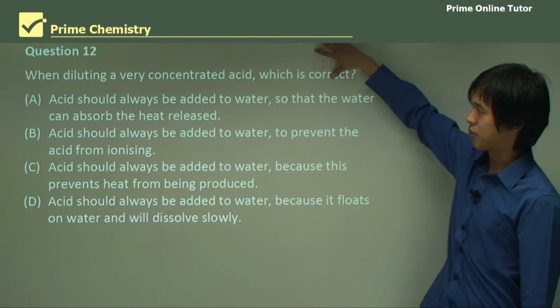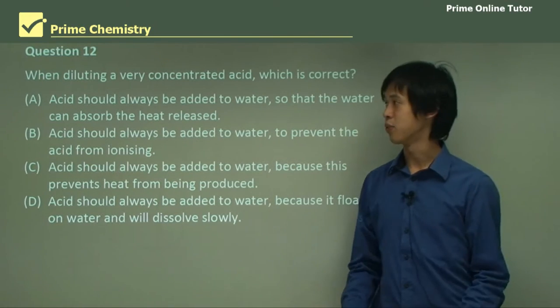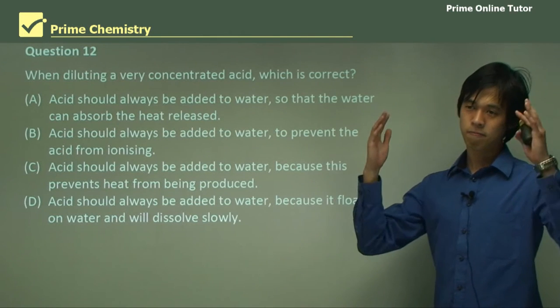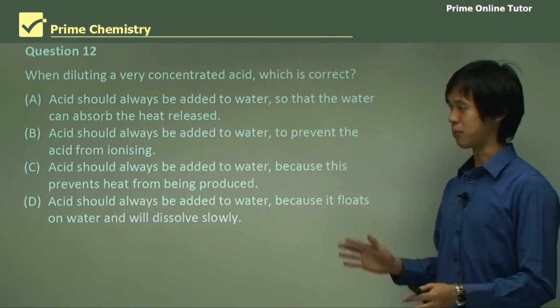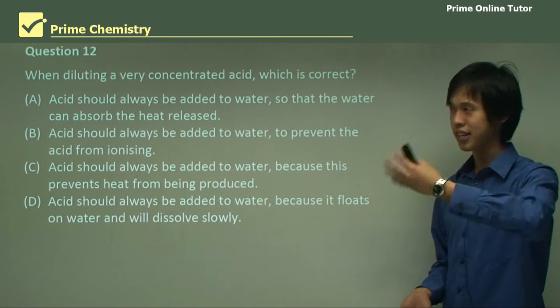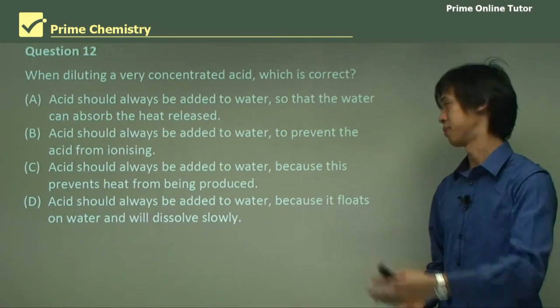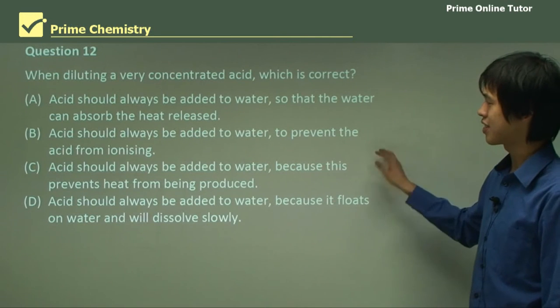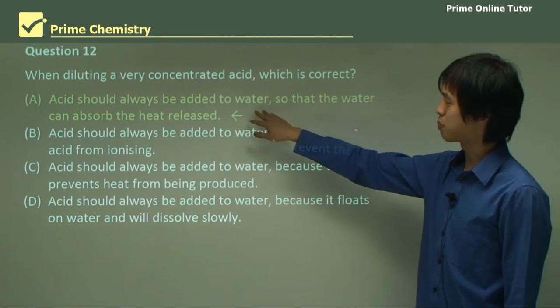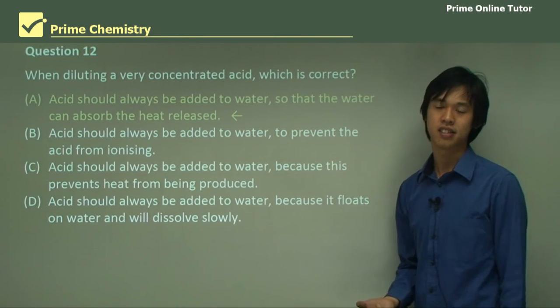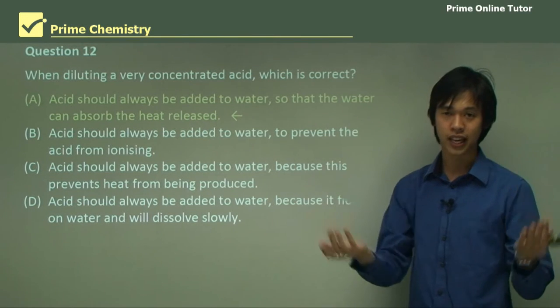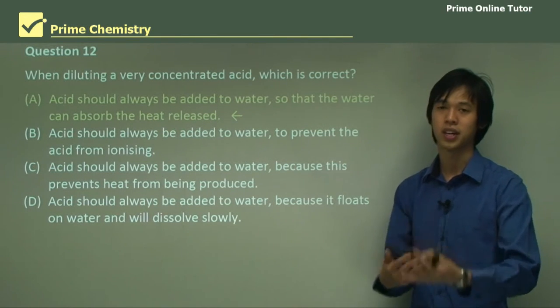The next major point: when diluting a very concentrated acid, which approach is correct? Always add the acid to the water — small amounts of acid to very large volumes of water. Acid should always be added to the water so that the large volume of water can absorb the heat released.